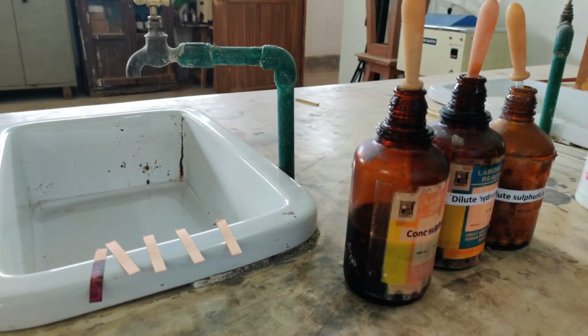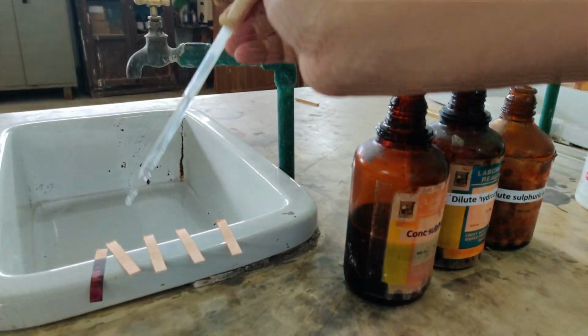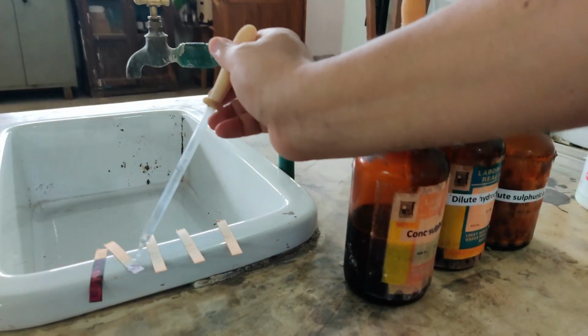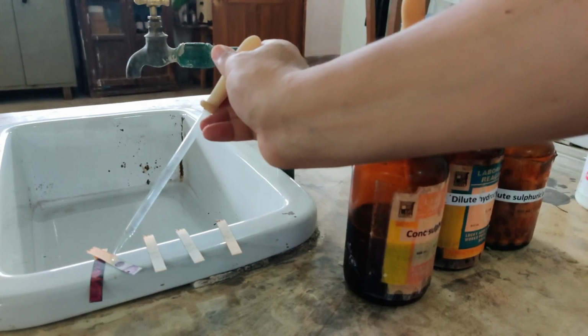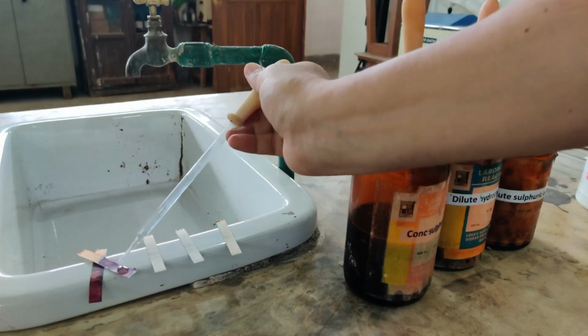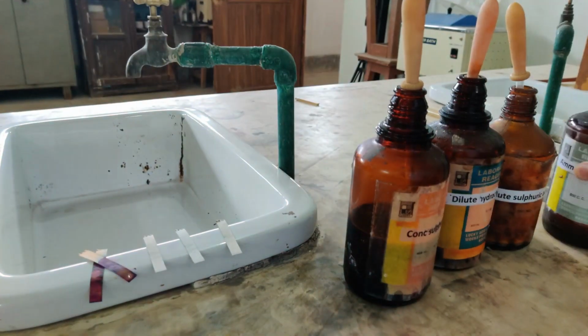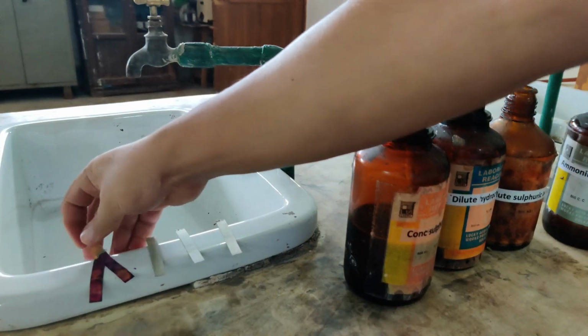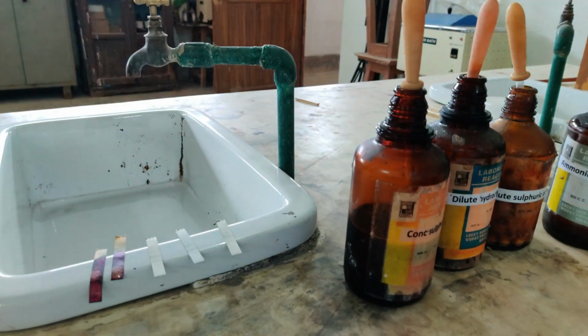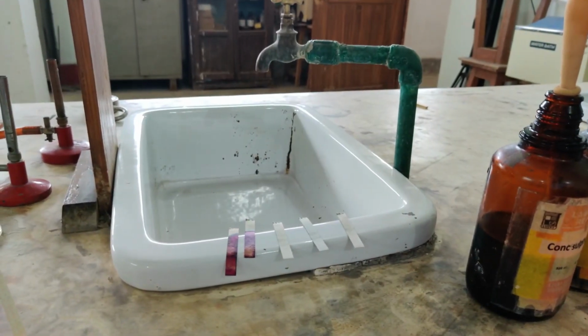Now the second paper I am going to drop there ammonium hydroxide. So let's see what happens when I am dropping ammonium hydroxide. Here you are, 1, 2, 3. Ammonium hydroxide. Let me separate the two. So this one is ammonium hydroxide. So since both of them are bases, that's why the colors are matching. In fact, they are very similar colors is what you see.